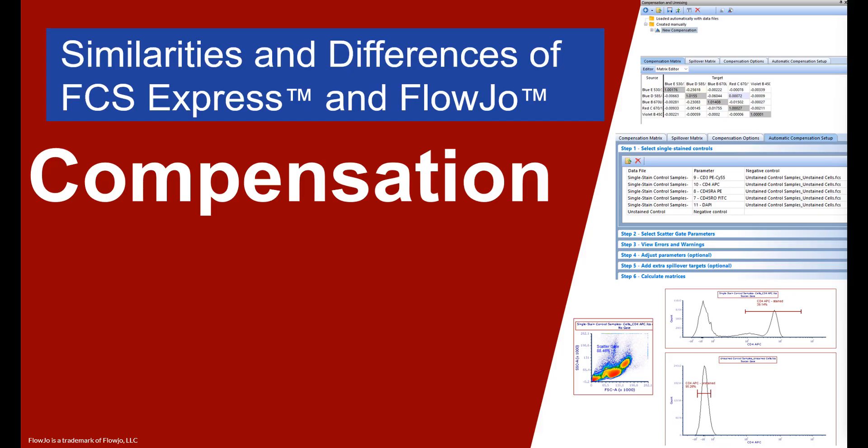Welcome! In this video, we will cover the similarities and differences when performing compensation in FlowJo and FCS Express. We will look at how to load your controls for compensation, use each of the wizards, examine the output of each wizard, and see how compensation is applied to sample data files when completed.